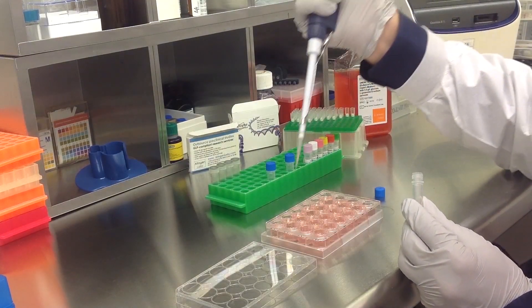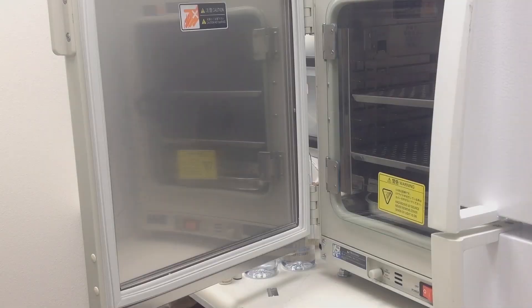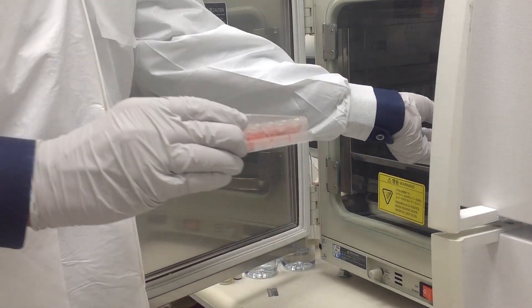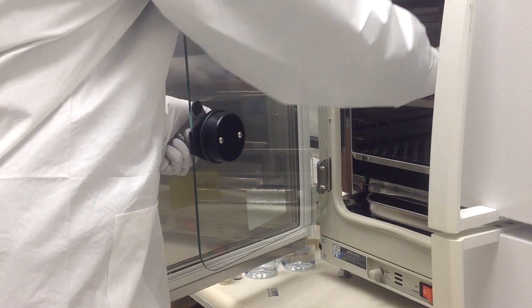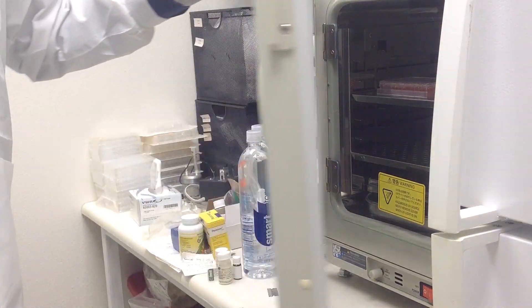Once you have treated all appropriate samples, incubate the cells at 37 degrees Celsius in a humidified carbon dioxide incubator. Assay for phenotype or target gene expression 48 to 72 hours post-transfection.